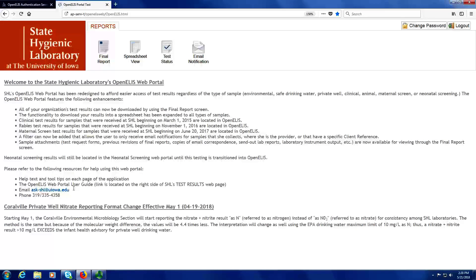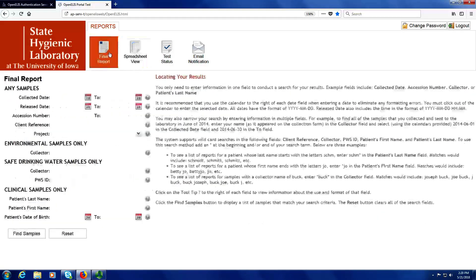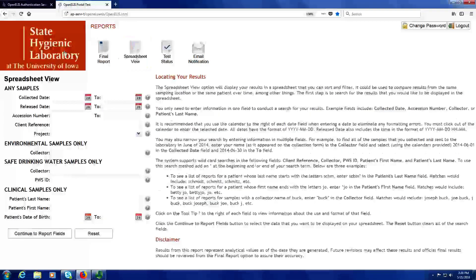After you log into the OpenELIS web portal, you'll see an orange banner in the top left corner with a series of buttons to the right of it. You'll also notice a welcome message, and if there are any relevant announcements, they'll be listed below the welcome message. You can always get back to this home page by clicking on the orange banner that says State Hygienic Laboratory.